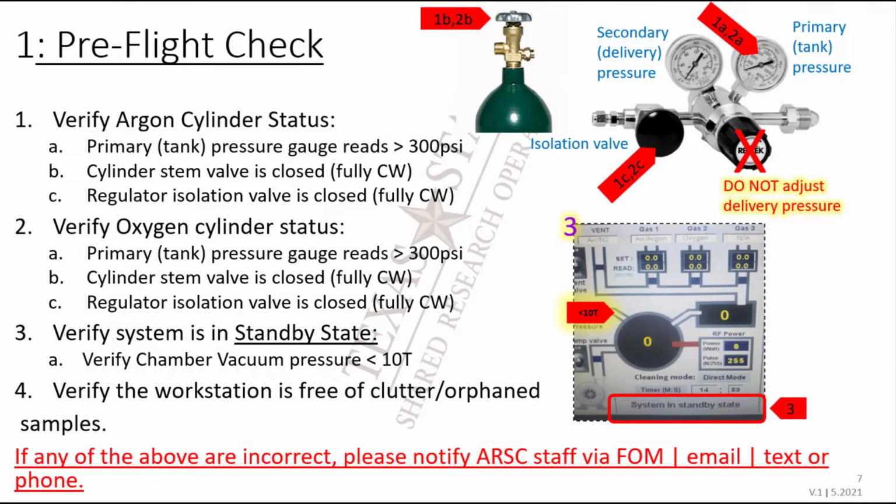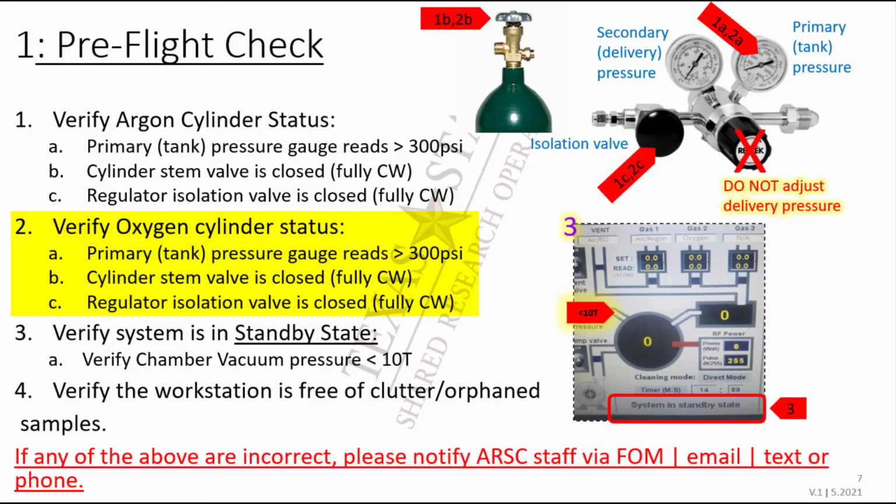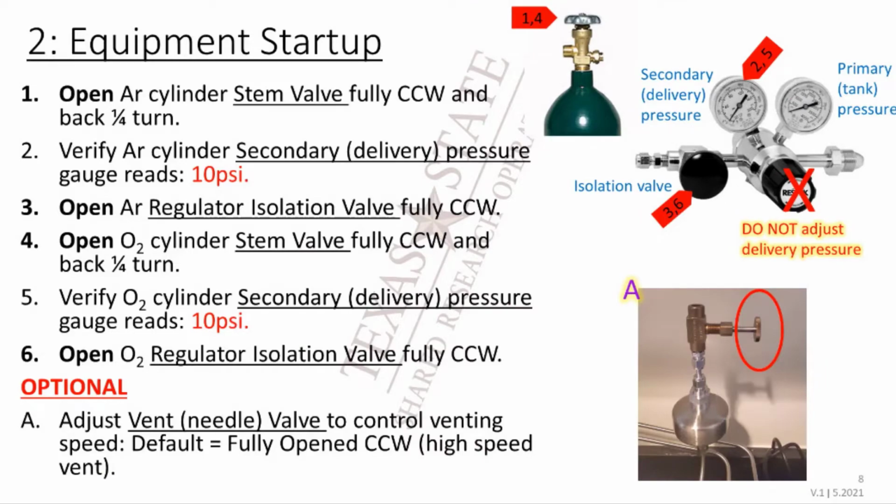Begin with your pre-flight check. Verify that the argon cylinder stem valve is fully closed, regulator isolation valve is fully closed, and the primary pressure gauge reads greater than 300 psi. Repeat for the oxygen cylinder and verify that the system is in a standby state. Verify the workstation is free of clutter and samples, and if any of the above are incorrect, please notify staff before proceeding.